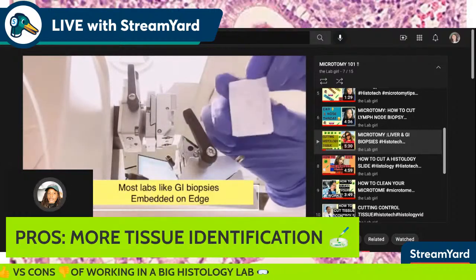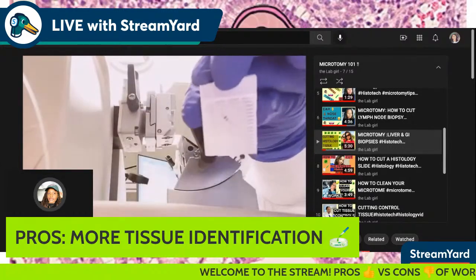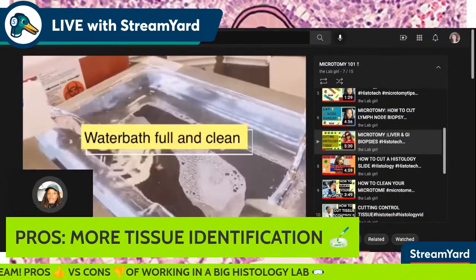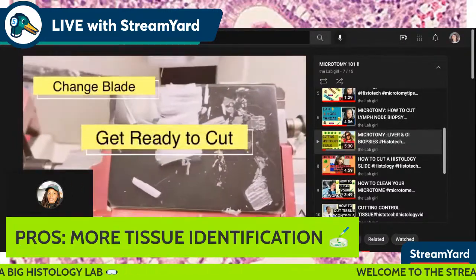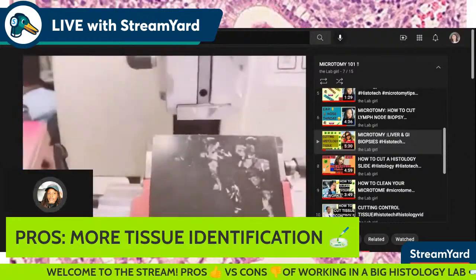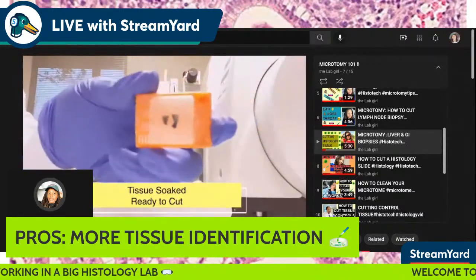and you actually will get familiar with the microns. You'll get familiar with how to embed the biopsies. But I think this was a good opportunity for you guys to see, okay, the tissue can be very scant, the tissue can be very small, the tissue can be very thin. And if you're not the one who is cutting, or if you're not the one who's embedding the tissue whenever you get it for microtomy purposes, then you're not really seeing what the tissue looks like. So let's go ahead and go to another.